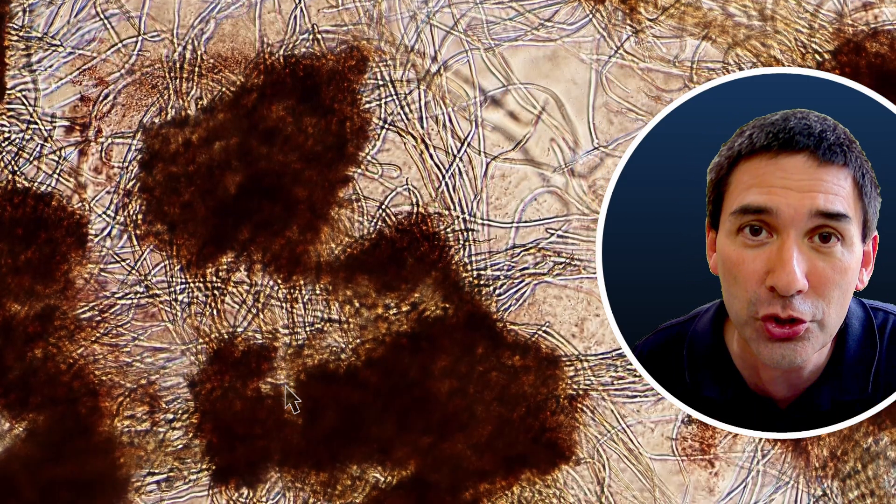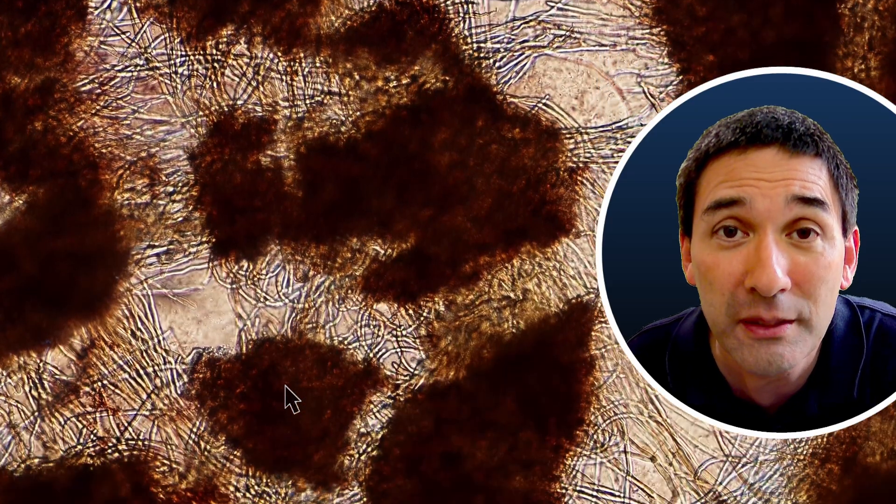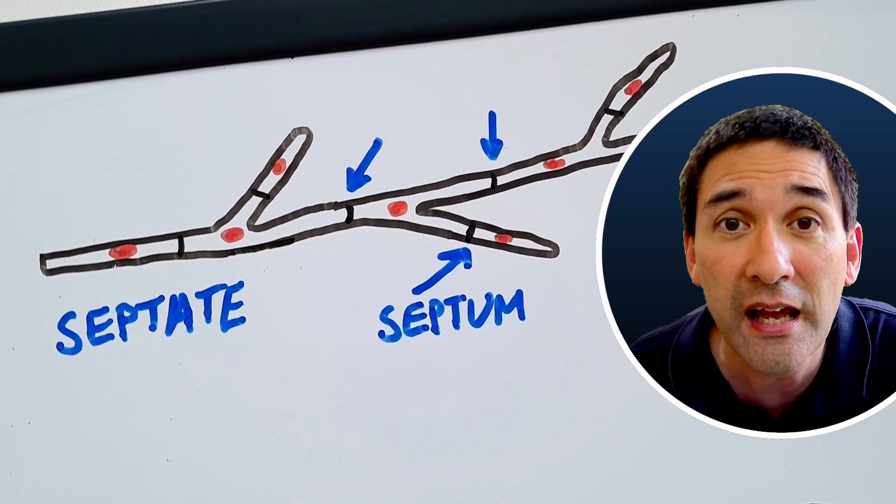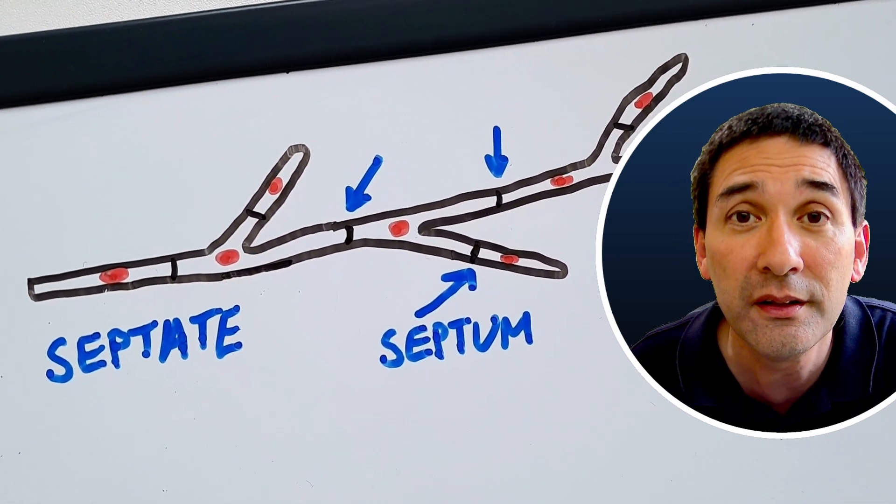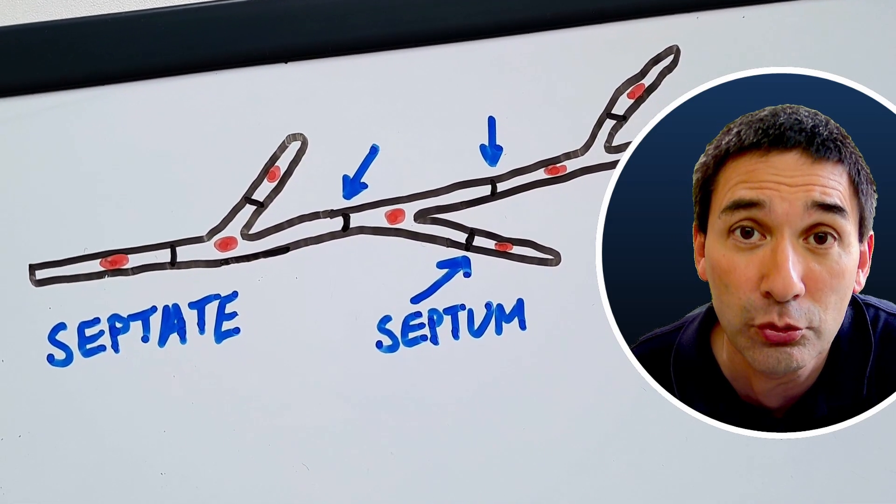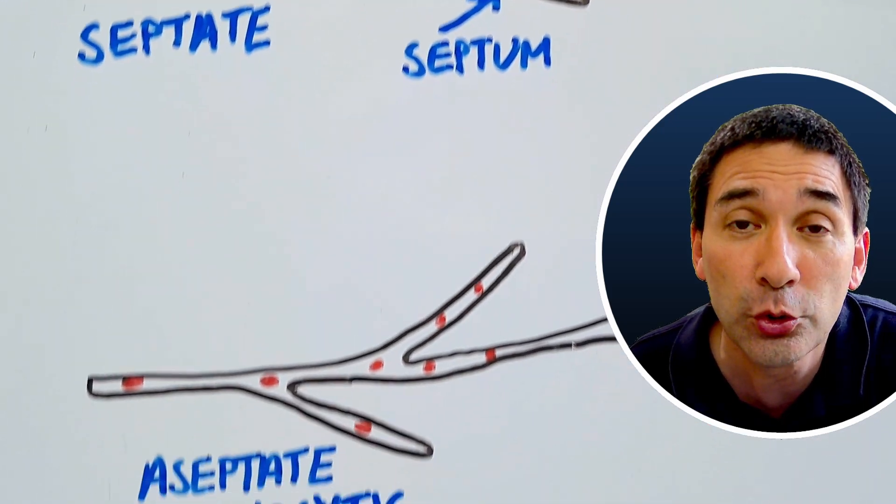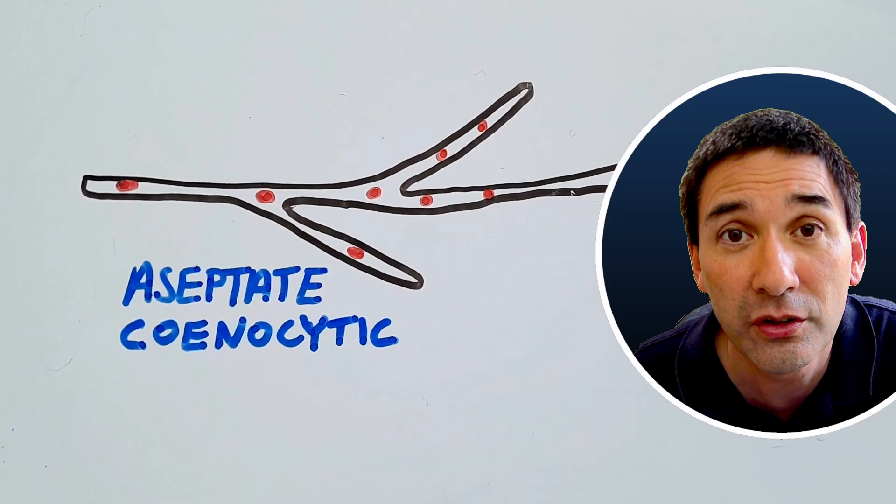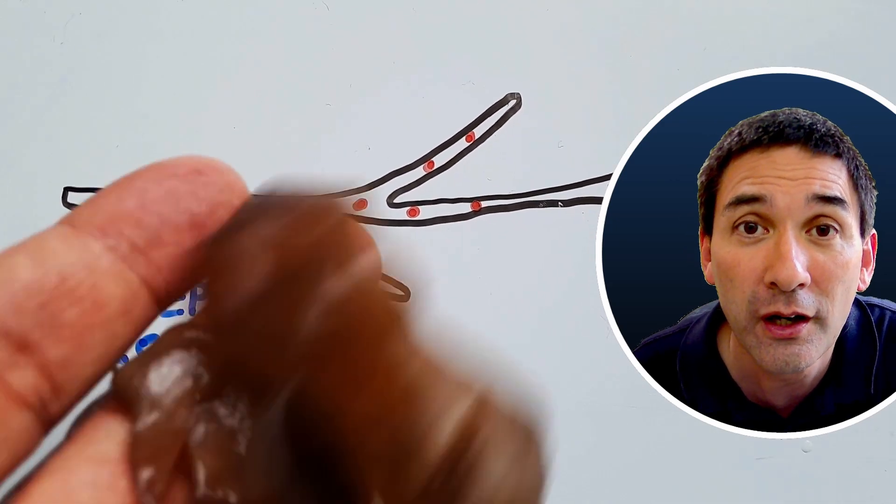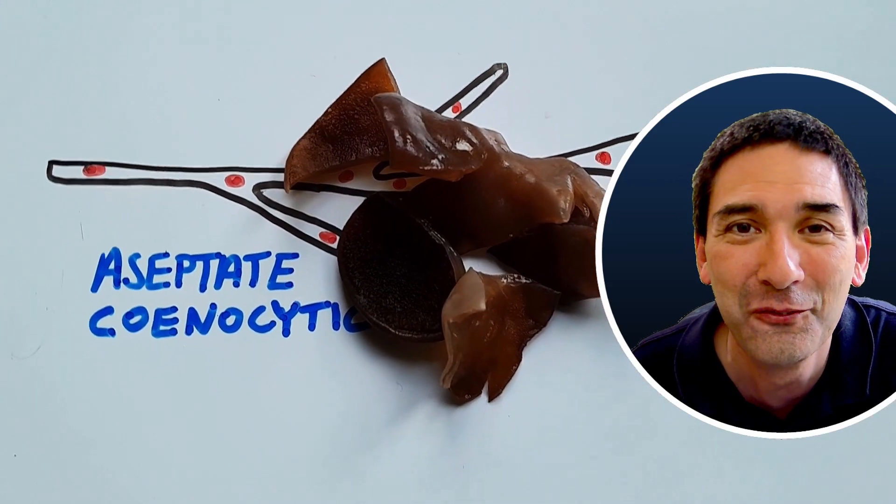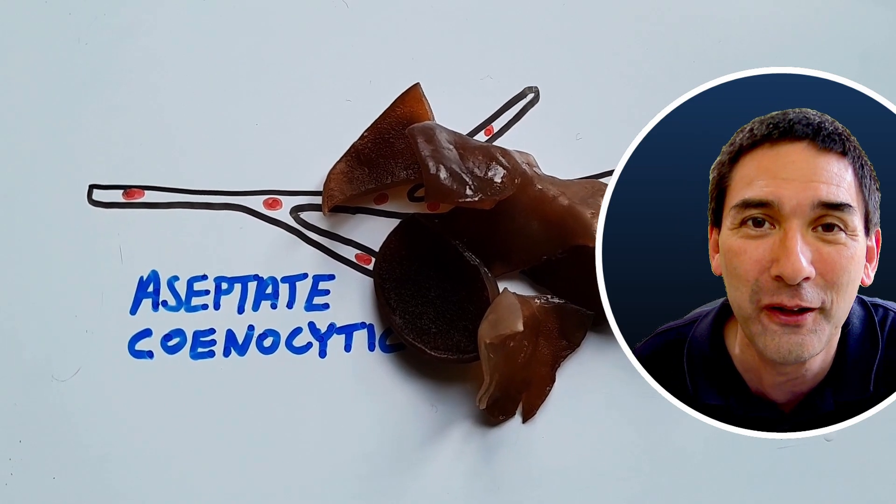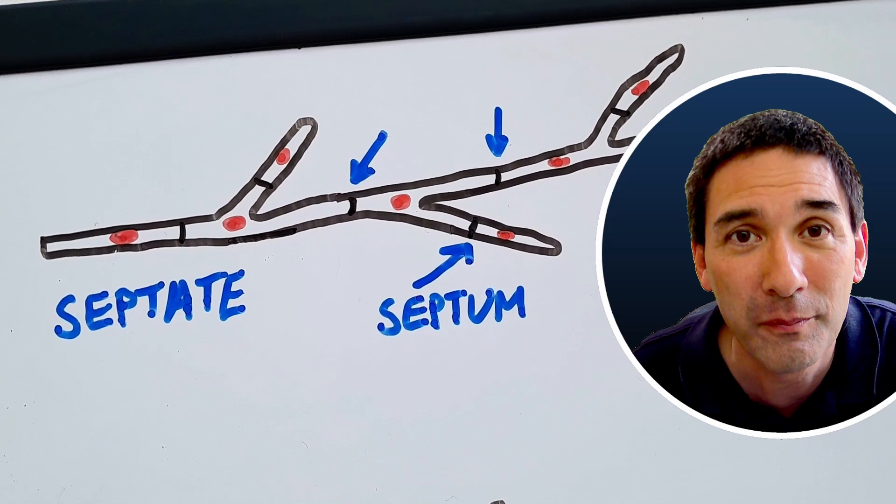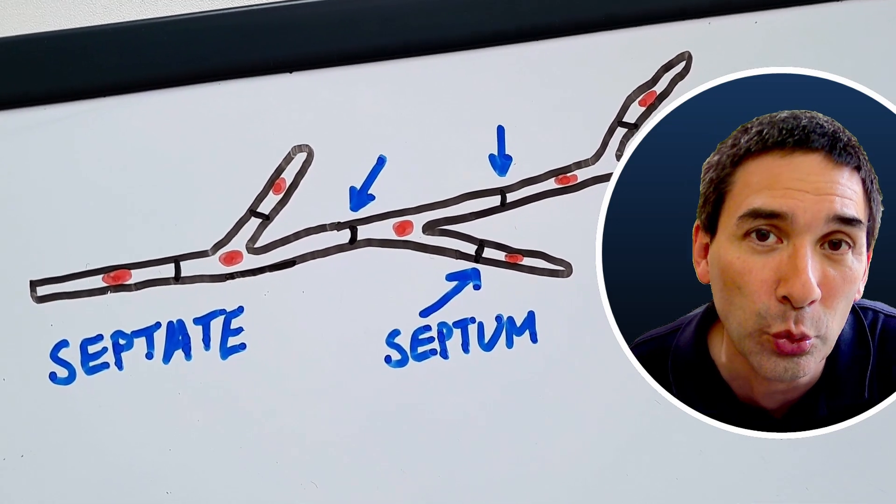And after a little bit of research, I was able to find out that of course there are different types of fungi: those that have septa between the individual cells, and these are the cross divisions here. And the red dots, these are the nuclei. And you can see that over here in the aseptate fungi, you have hundreds of nuclei in one hyphae. And it's different from those septate fungi where each cell has its own nucleus here.